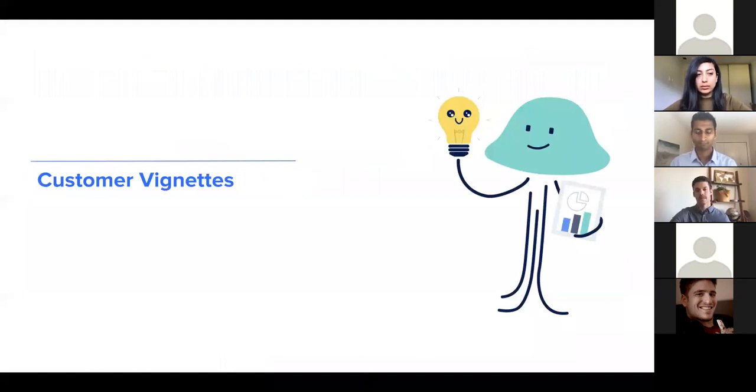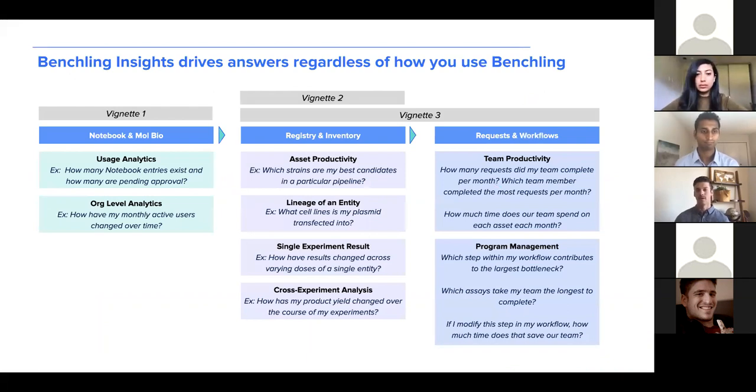So today we'll be introducing an Insights webinar organization and going through some customer vignettes of researchers and day-to-day activities that they might be using the Insights application for. In this Insights webinar organization, the organization is a strain engineering company that is tasked with using microbes to produce high-value chemicals from an eco-friendly feedstock.